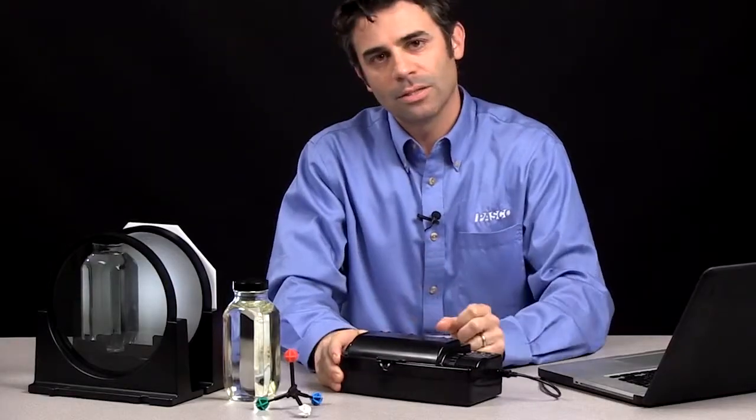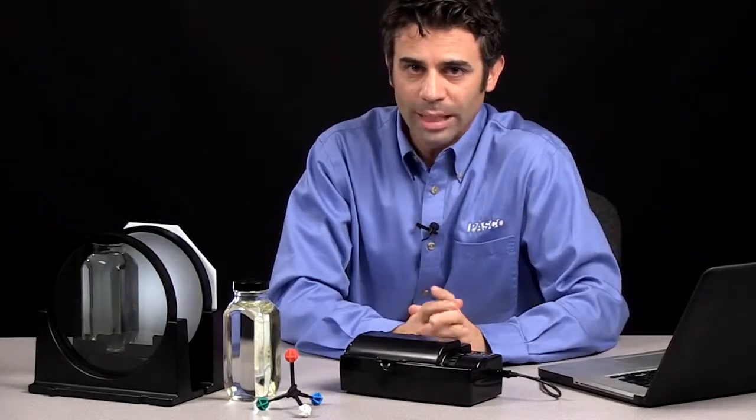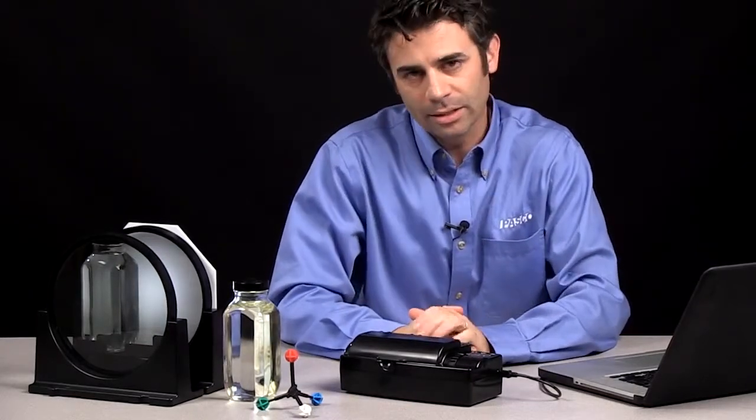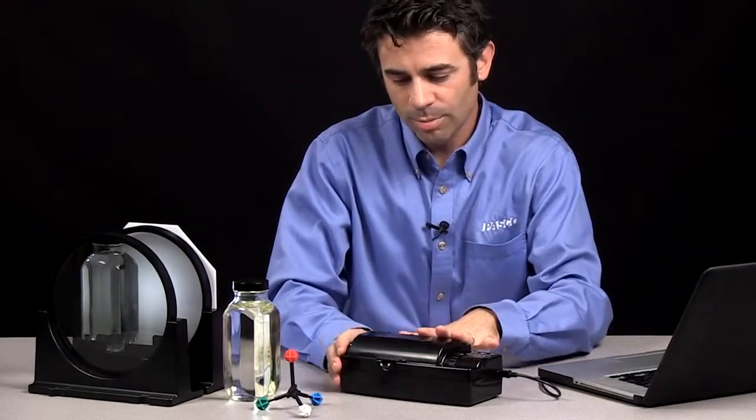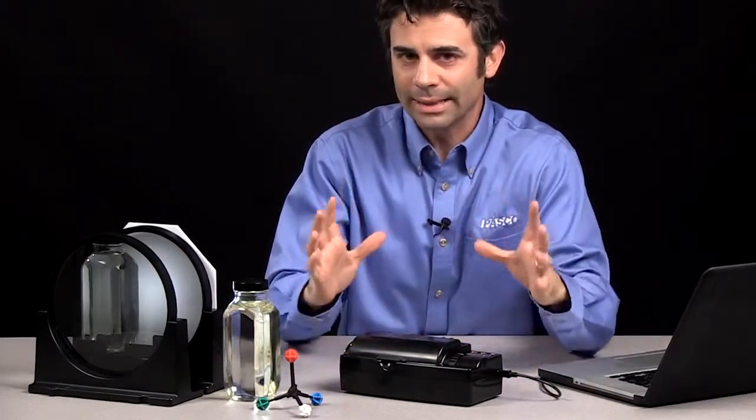So the polarimeter is a device used to measure the rotation of plane polarized light by optically active compounds. Before I get into the polarimeter, I just want to tell you a little bit about what that sentence means.